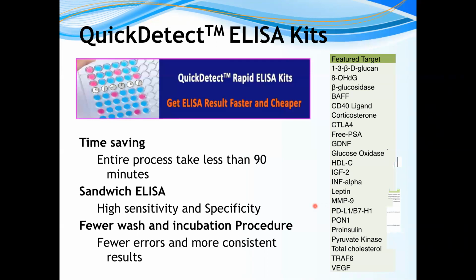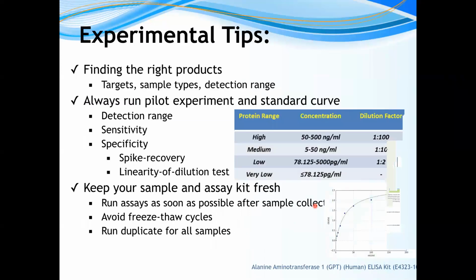Now I would like to sum up this webinar by giving you some experimental tips. If your customer has some problems using our kit, or they were setting up their own experiments and are not getting the desired results, I know that it is often very frustrating and very time consuming.